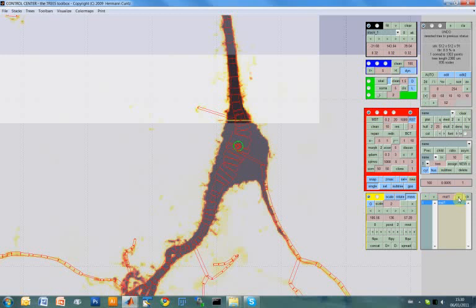And by the way, down here is the tree folder structure. We see that there is one folder containing one tree, and if I press this MST button again, which would grow again a tree onto the target points we had before, then it will create a second folder with another tree. This is the new reconstruction, which we should give another name. We can clear this, and then we see we have again the tree that we had before.